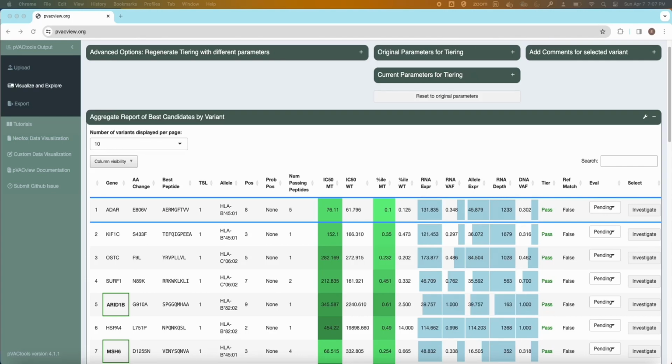Welcome to the pVACview demonstration. In this video, we'll walk through launching pVACview through the terminal or RStudio.